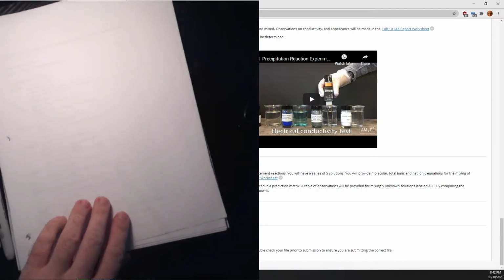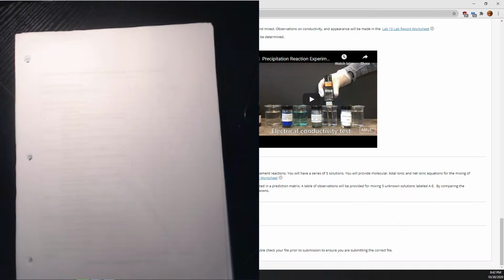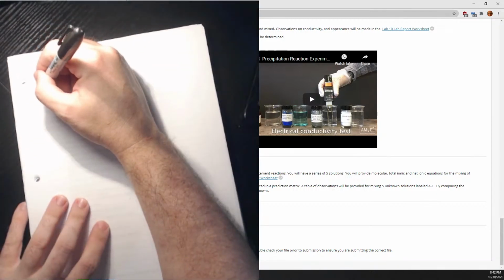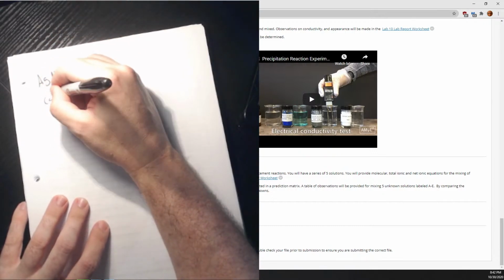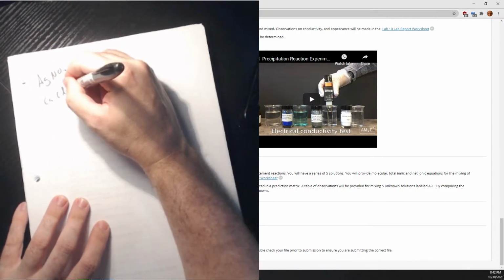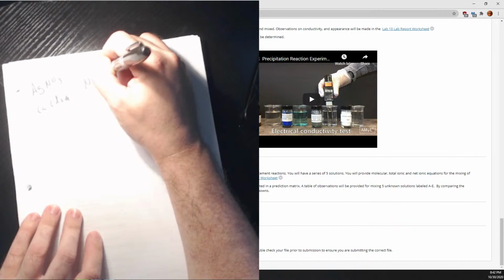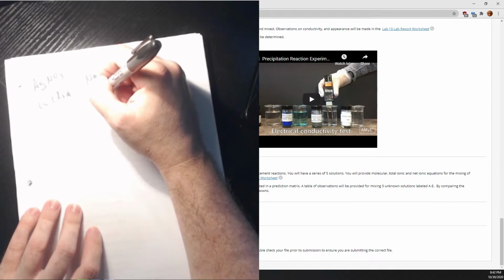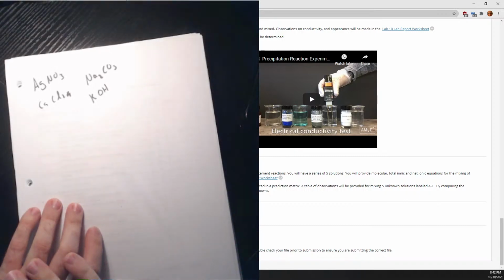All right, so you are going to be mixing a bunch of different salts, and you'll be predicting the results of those mixings. So let's say, I don't know what salts they're actually going to give you, but let's say silver nitrate, calcium chloride, let's go with sodium carbonate, and let's make a fourth one. How about potassium hydroxide? There we go.